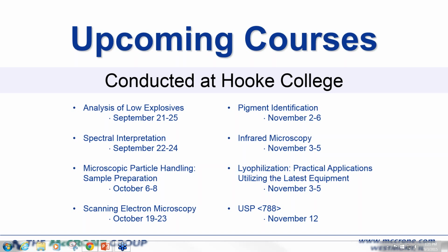Yeah, and I think furthermore, again, I like ATR in a lot of ways, but it has some limits. And one of them is that not all components in a mixture will make contact equally with the ATR crystal. And so you can sometimes get some self-selection in that regard. And we've encountered that on a few occasions with mixtures.